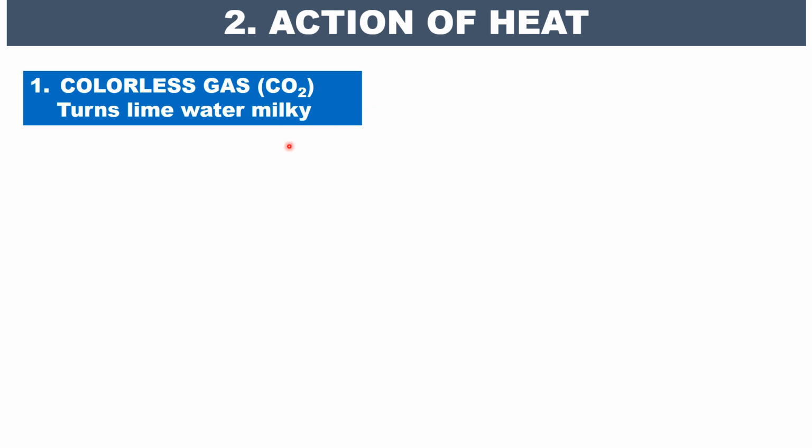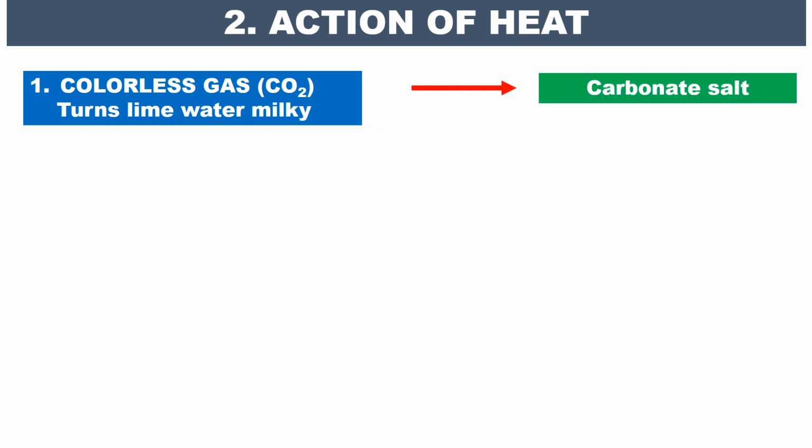that means the salt is a carbonate. Carbonate salt on heating gives carbon dioxide gas. In another test tube you take lime water, slaked lime, calcium hydroxide.